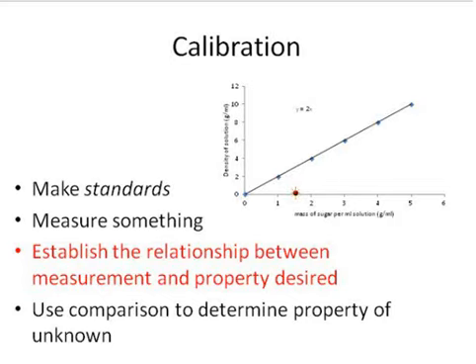So the equation that describes what happens when you have a line is y equals mx plus b, and I'll type that in over here because I forgot to put it on the slide. So y equals mx plus b, and the idea behind that relationship is y is, again, the dependent variable, x is the independent variable, m is one of the parameters of the fit, and b is one of the parameters of the equation.